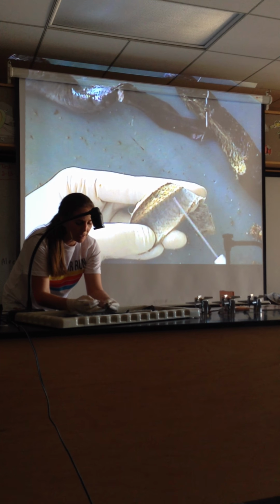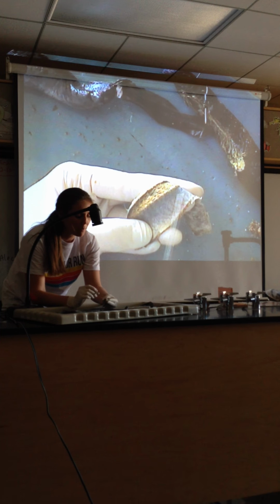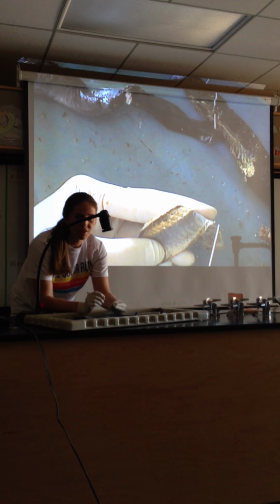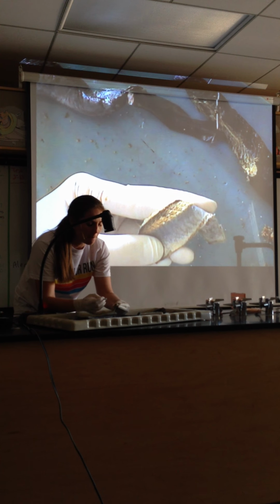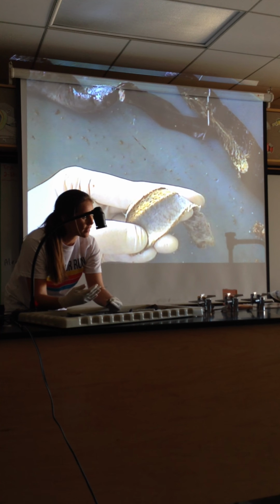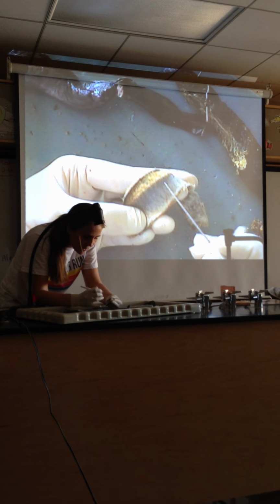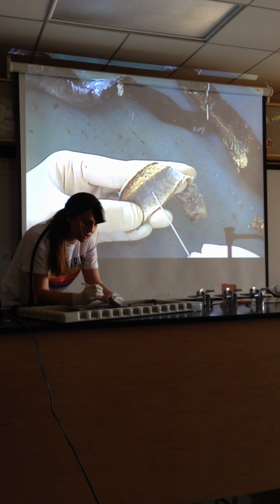All right, I asked you to identify myotomes and myoseptums. What you're looking at is a piece of flesh here from the lamprey. You're going to skin the organism, and you're going to be able to note these. Just to give you a definition, myo references muscle, and septa is something as a division of. So if I'm talking about a myoseptum, I'm talking about a division of a muscle fiber. If you have a fillet of salmon or you're eating fish, you notice that there's lines on the salmon between the actual meat itself, which would be the myotomes or the muscle. That's what you're looking at here.